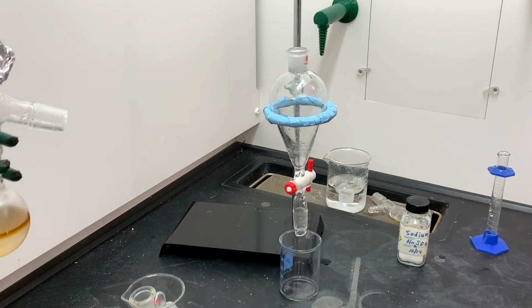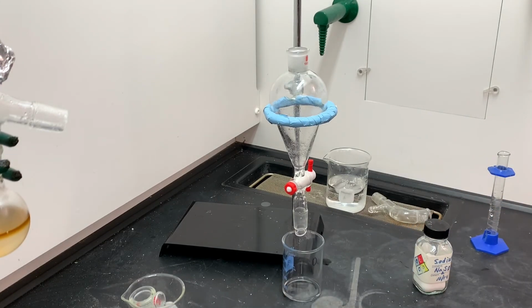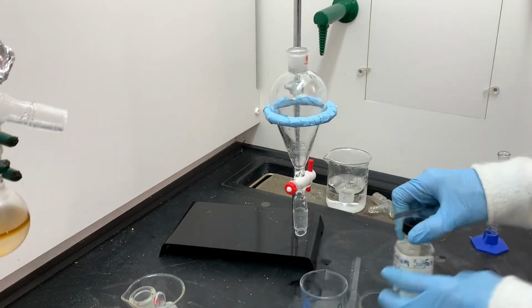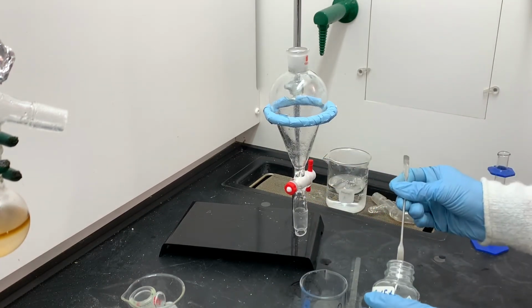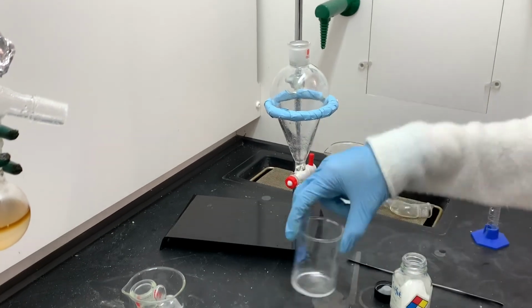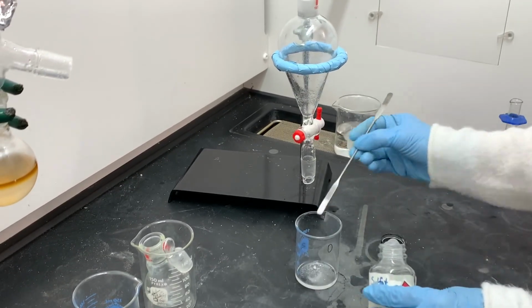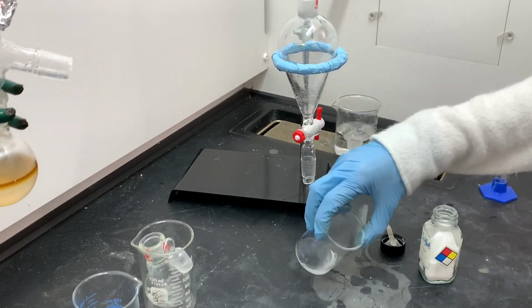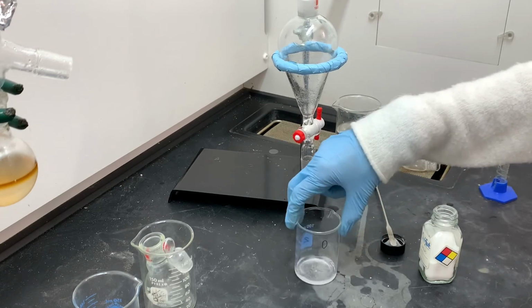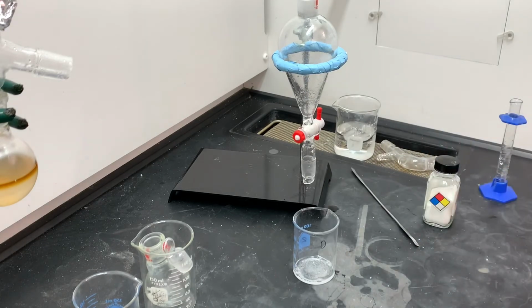And then the very last thing I'm going to do here is just add a little bit of drying agent, anhydrous sodium sulfate. This drying agent is going to suck up any water that might still be trapped inside the organic layer. When we add this drying agent to our beaker, we're just going to add a small scoop, making sure that we have granules that don't clump together. It's not taking a whole lot. I can see that I've got some free-floating granules down in there, which means that it's nice and dry.